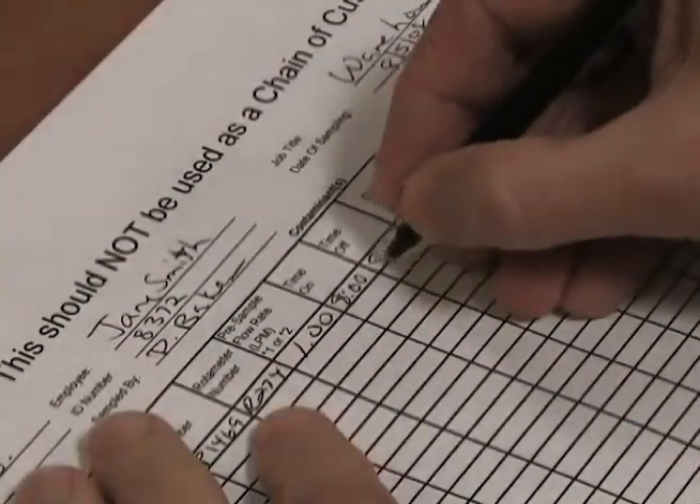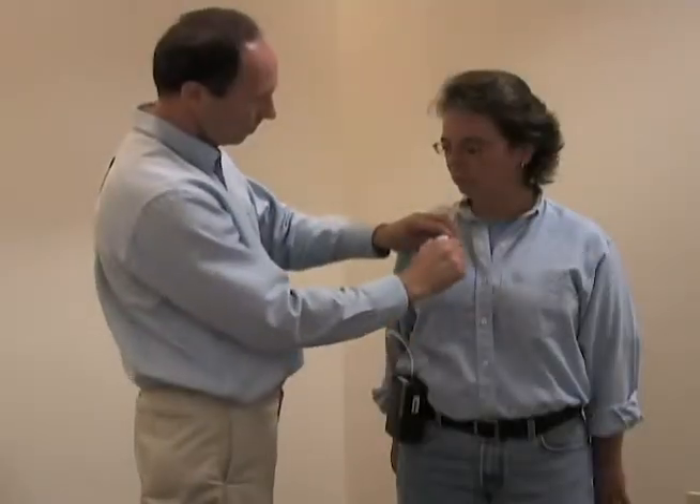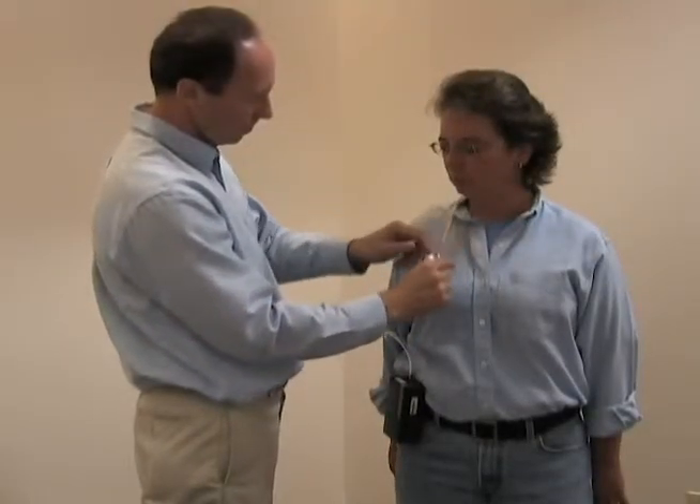After sampling is complete, turn off the pump and record the time. Remove the filter cassette and install the colored nibs on both sides.